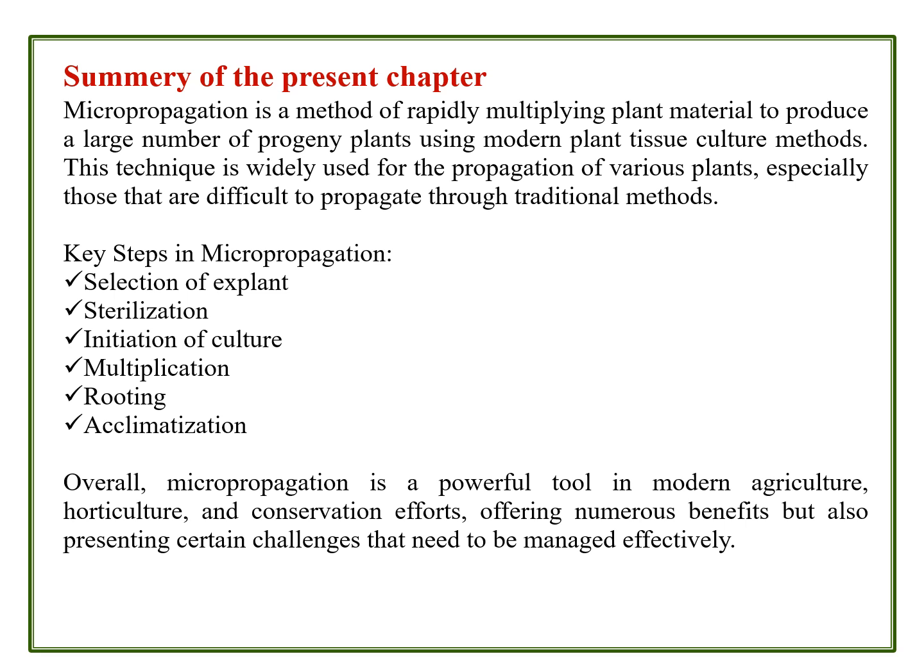Then sterilization: after selecting the explant and finishing the media preparation, by autoclaving or dry heat sterilization, all the materials will be sterilized. Then followed by initiation of the culture, where the plant material as an explant is taken from the mother plant and introduced onto the defined medium.